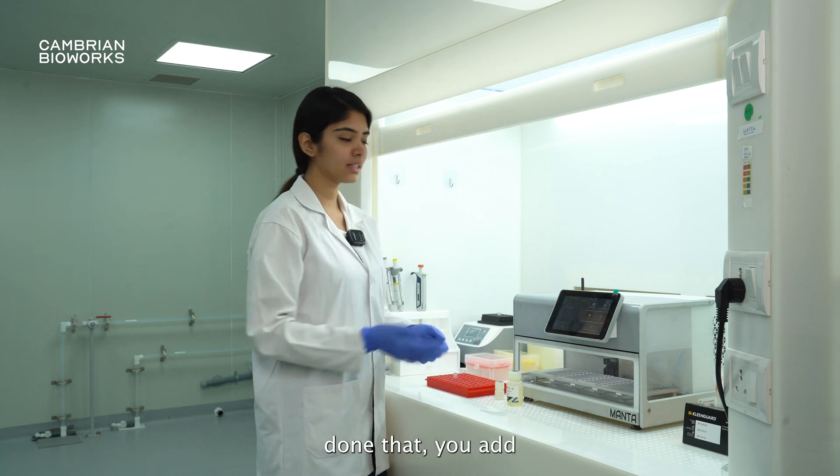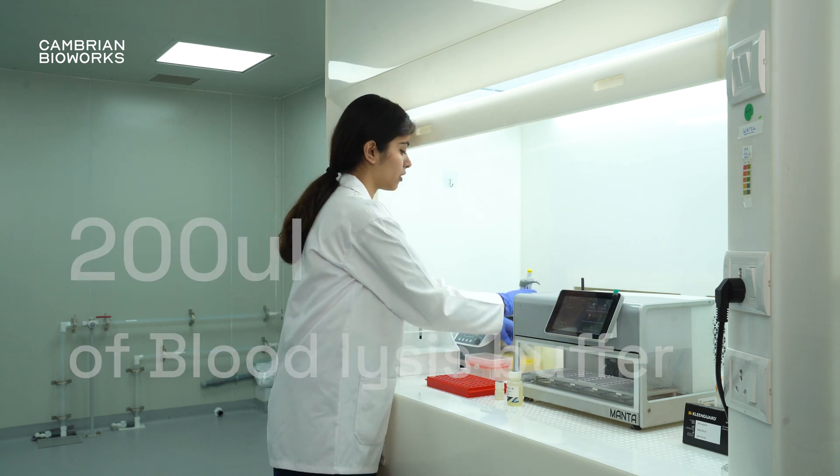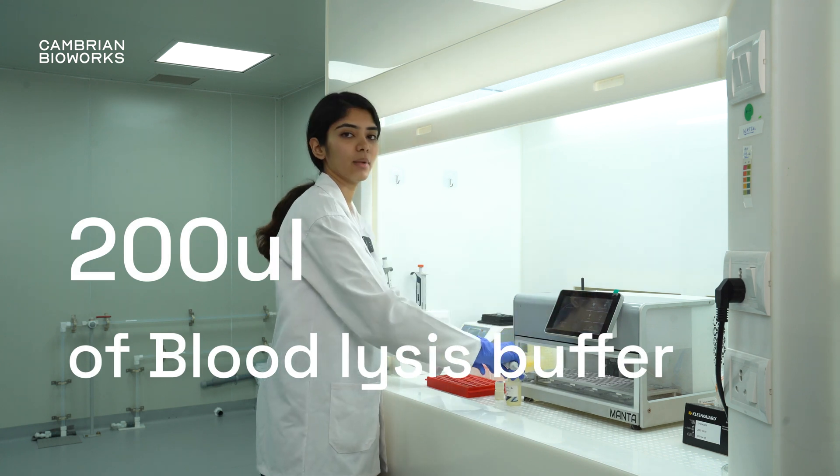Once you've done that, you add 200 microliters of the blood lysis buffer.